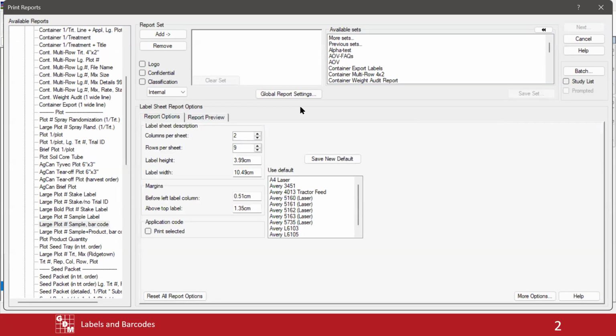so hopefully that's helpful. I kind of suspect if you've never used barcodes, maybe there's a chance you really don't have a workflow that would need them, but maybe not. So that'd be the reason why it would matter.